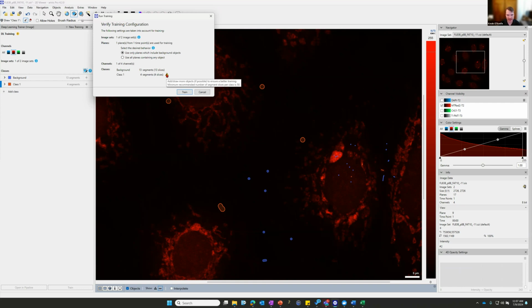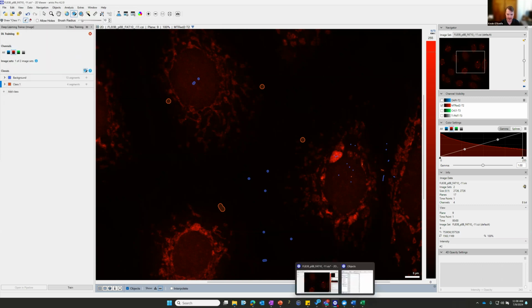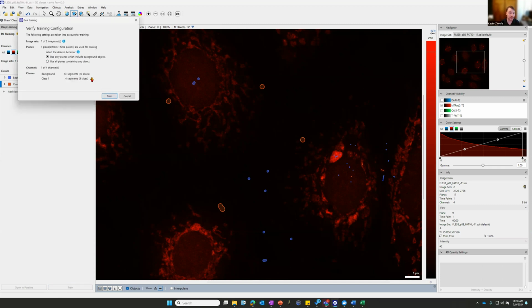It's going to give you a warning if you try and train it too early. It's saying in this case that you just don't have a lot of objects for this class, and that it recommends at least 50. This is just a recommendation. I usually do just get to that 50 mark. And again, it's not going to not train on it. It's just the quality of the training is better with the more annotations that you have. So then when you hit train, maybe I'll try this. It might give me an error because I just don't have a lot. In that case, it is. Okay, so we would need to add more annotations, but once you hit train, it will give you an error if you don't have enough.